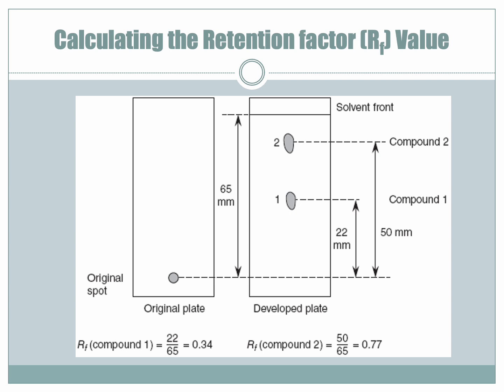There might be more than 2 though, because there might be a 3rd compound that's hidden underneath one of those spots, which is to say that there might be 2 compounds that have very similar properties and travel at a very similar rate, so it might be hard to separate them. But what we can say for sure is that spot 1 and spot 2 are not the same compound. They're definitely different compounds. So there's at least 2 different compounds in this solution.